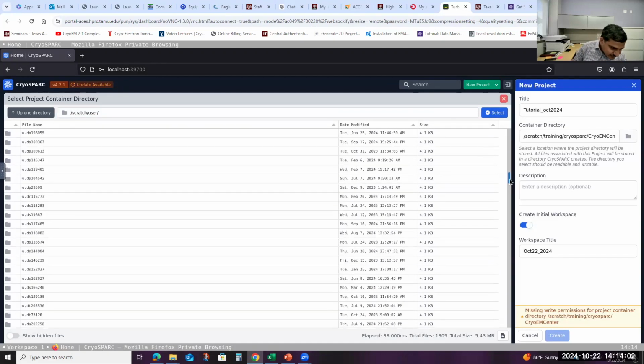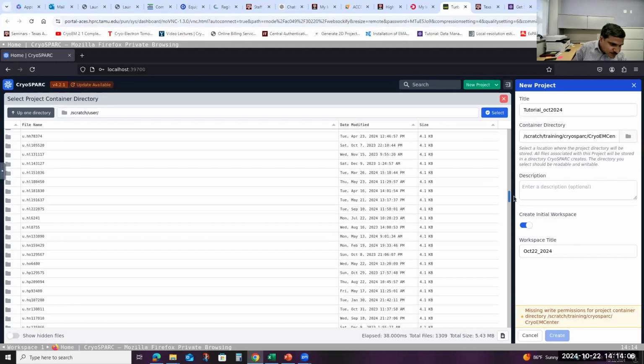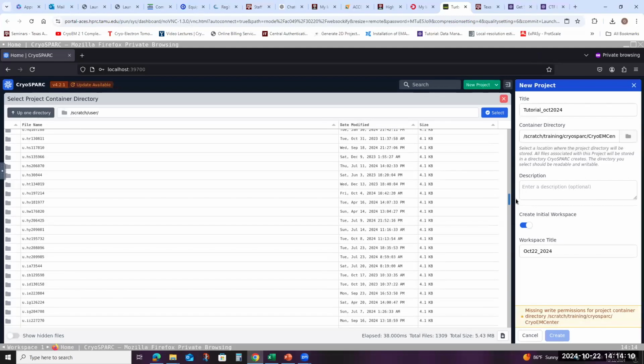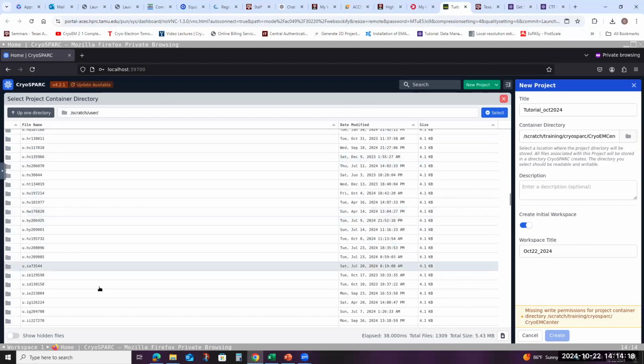Sorry, I have to find the username. Can we use the search function on top? Can you use the search box?